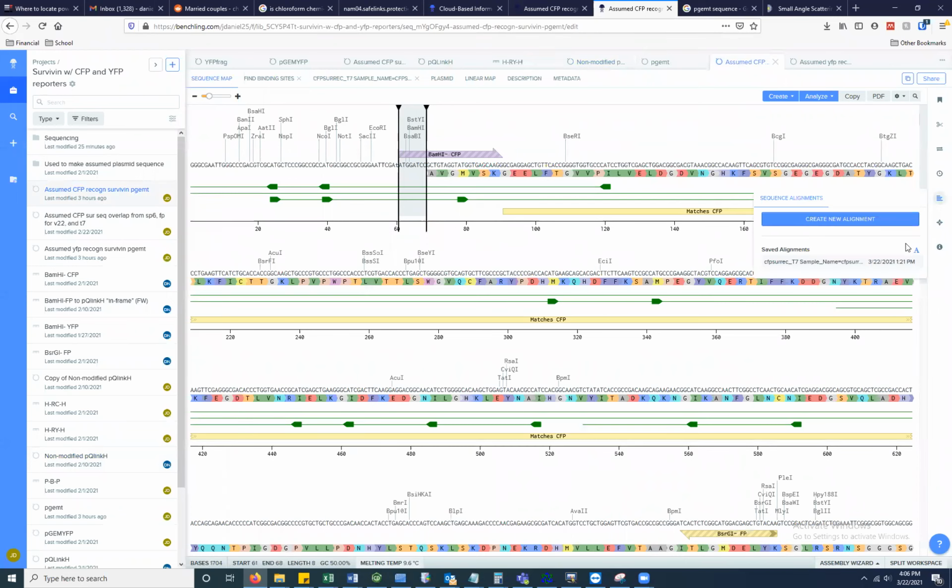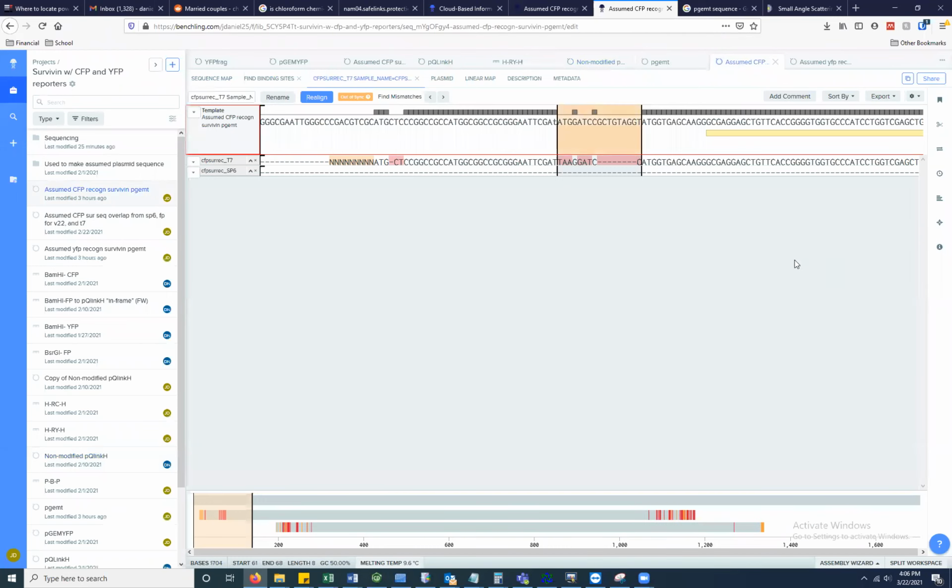If you have an alignment that doesn't agree here, in this case the dashed lines are on the bottom, but they could be on top as well. It just depends on if this comparative sequence is longer or has a big gap, or this top one does.